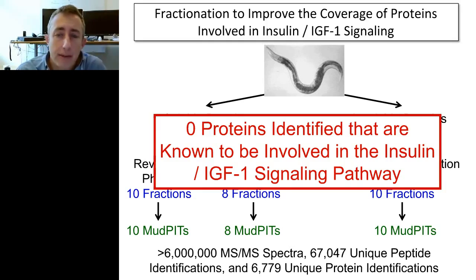We were just sampling the most intense features that were in the organism, the most intense 6,000 or 7,000 proteins, and a lot of the proteins that were interesting to us in trying to understand this biochemical pathway were things that we weren't even beginning to characterize.